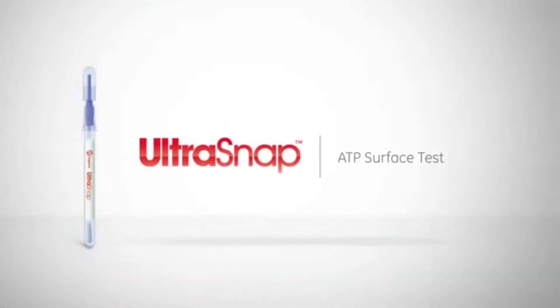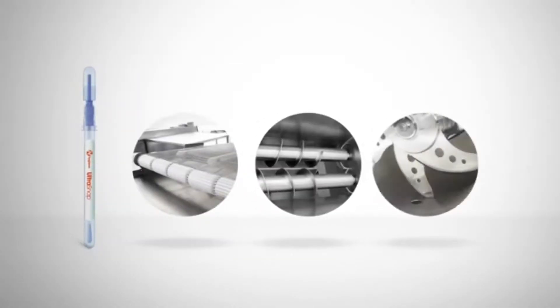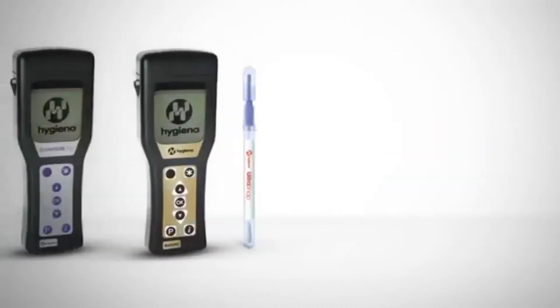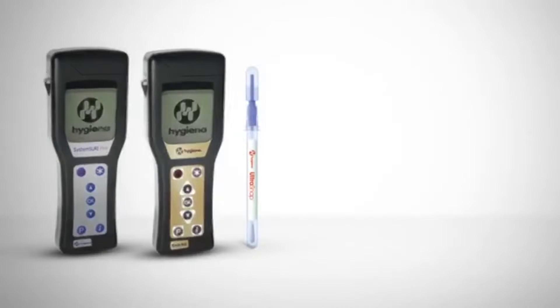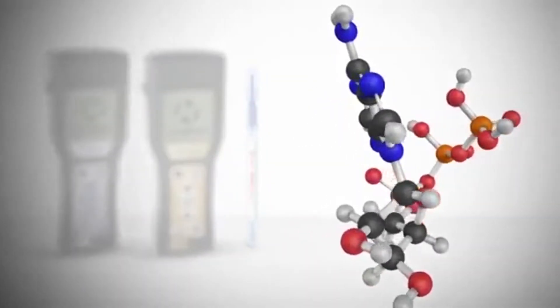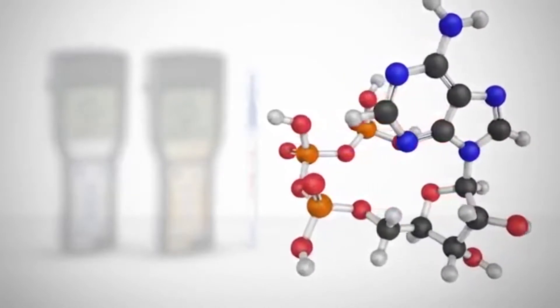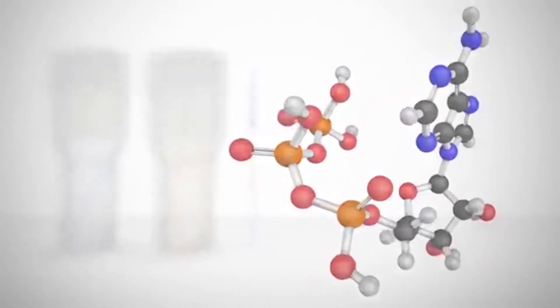UltraSnap is a user-friendly ATP test used for assessing the cleanliness of food contact surfaces and other processing equipment after cleaning. Together, UltraSnap and Hygiena's handheld meters measure the ATP present in a sample. ATP is the energy molecule found in all living cells, and the presence of ATP signifies whether or not a surface is clean.